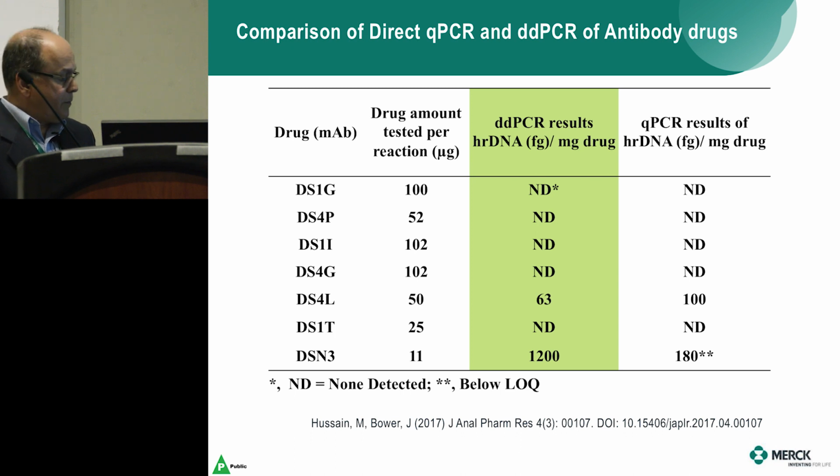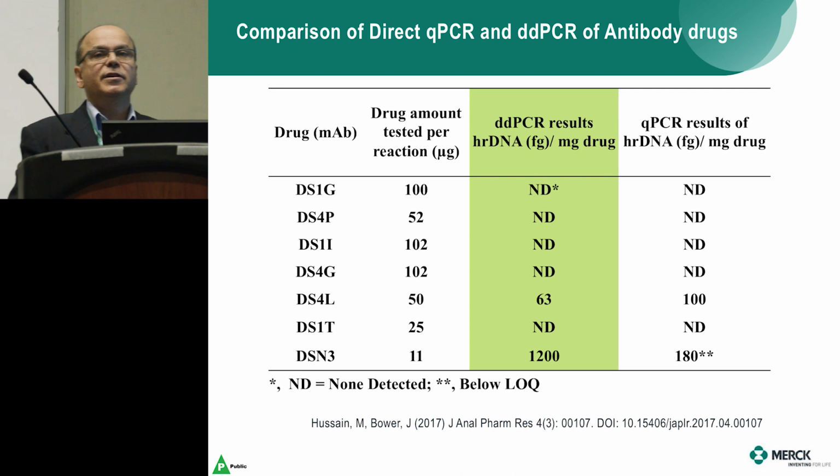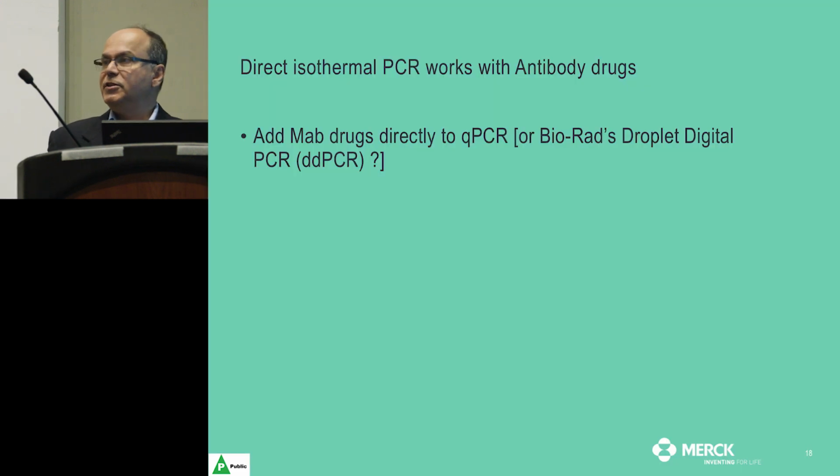So now the question is, if we go back to that model of DNA extraction and testing, and our desired model of not extracting DNA and testing the sample directly.